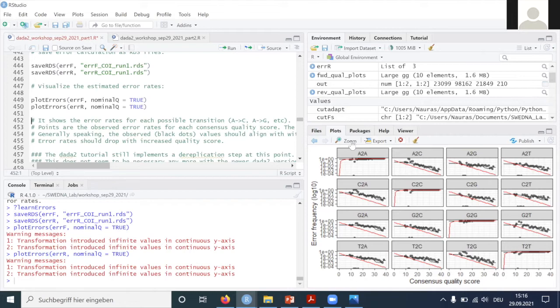That being said, I have had deviations in runs that we've subsequently found to be very poor sequencing runs that we just had to redo entirely. So an over-clustered flow cell will have very dirty looking data that you will see in FastQC. And at that point, many users will just resequence rather than continue. So I suspect that if you have a smaller problem that's less obvious, it would show up here. All right. Okay. Thank you. You're welcome.